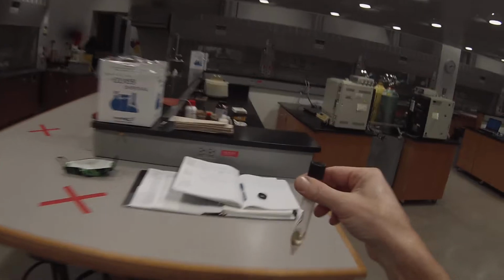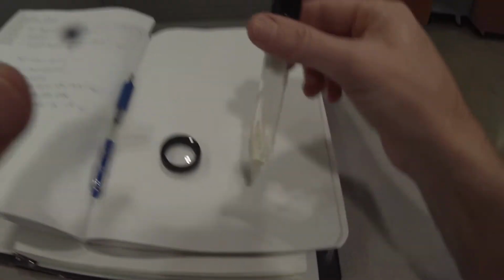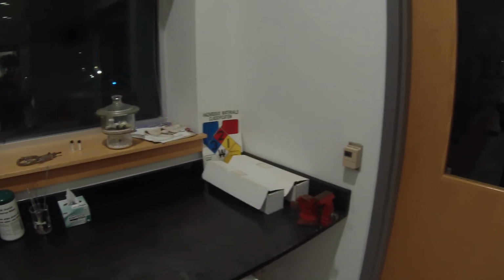That looks pretty clear to me. Pale yellow, very, very slightly yellow. And not cloudy anymore. So we're just going to parafilm that up and stick it in the freezer. And I already have a box in there that has some samples from a later lab, from later in the semester. So I'll just add that to the box.